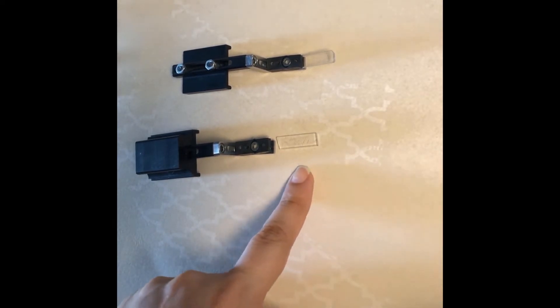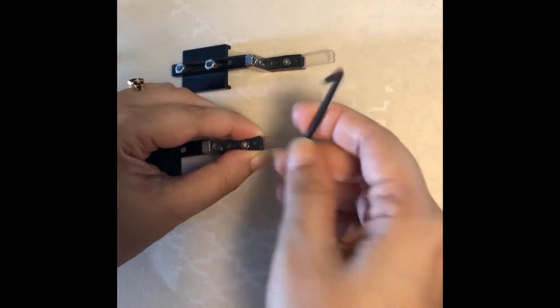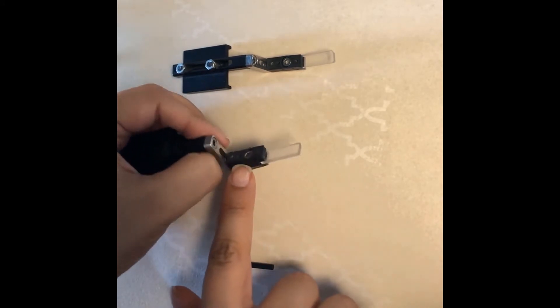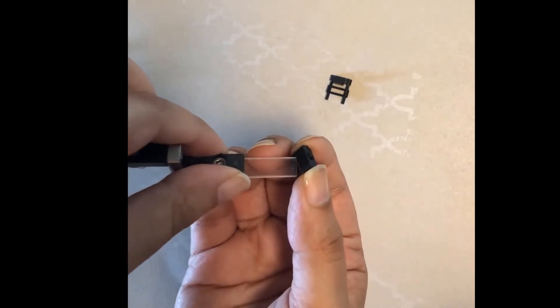First, attach the glass support using an m2.5 hex key. Don't over-tighten the screw or you might bend the sample holder. Next, use one or two pinchers to hold the sample in place. Choose from the three pincher types depending on where you want to image your sample.